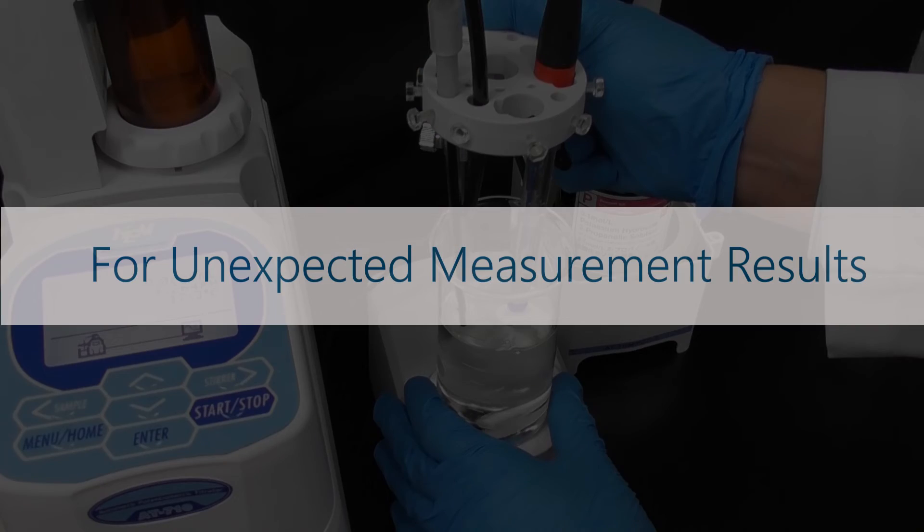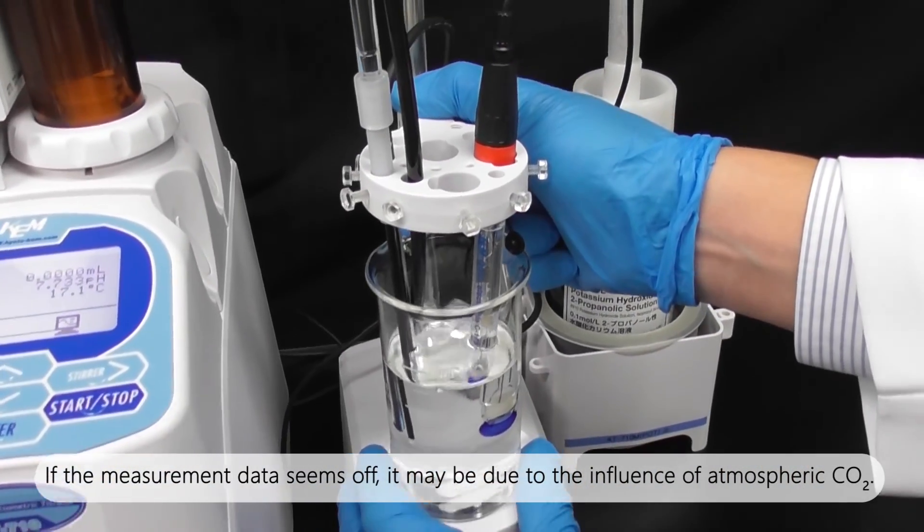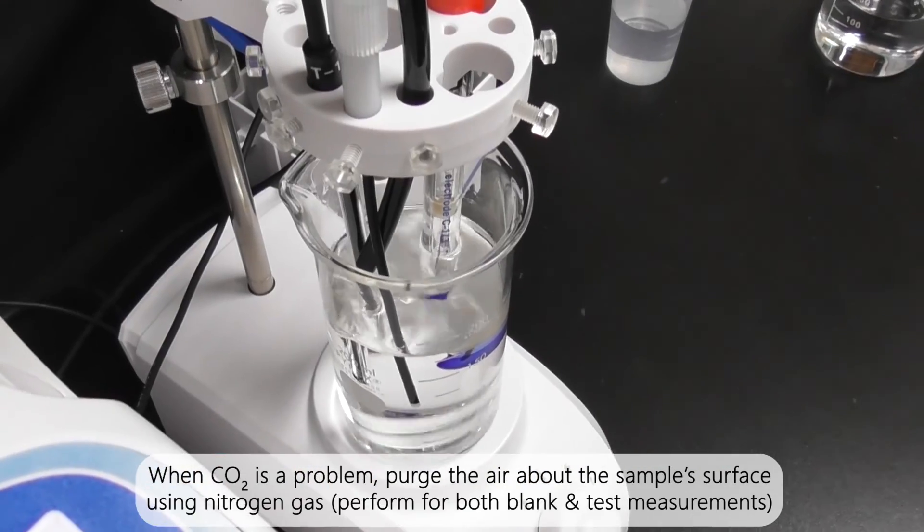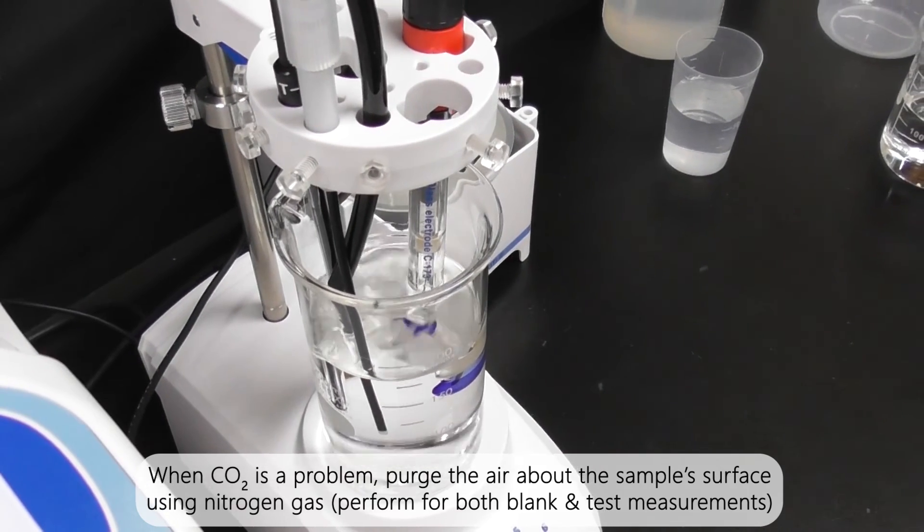For unexpected measurement results: If the measurement data seems off, it may be due to the influence of atmospheric carbon dioxide. When carbon dioxide is a problem, purge the air around the sample surface using nitrogen gas.